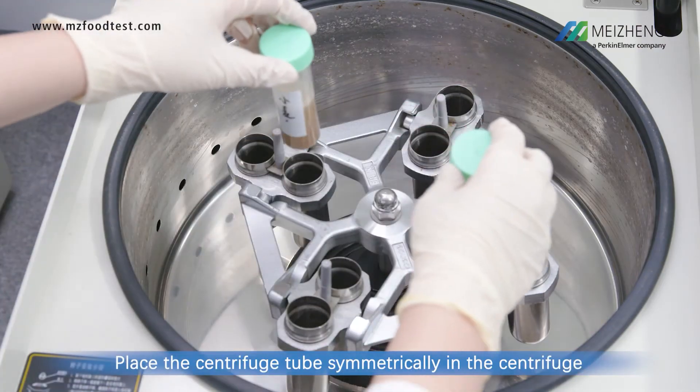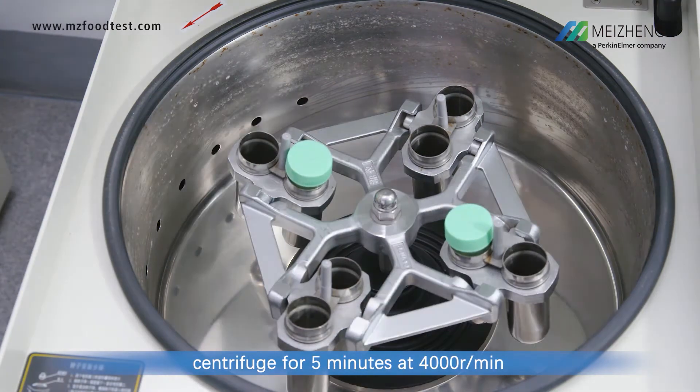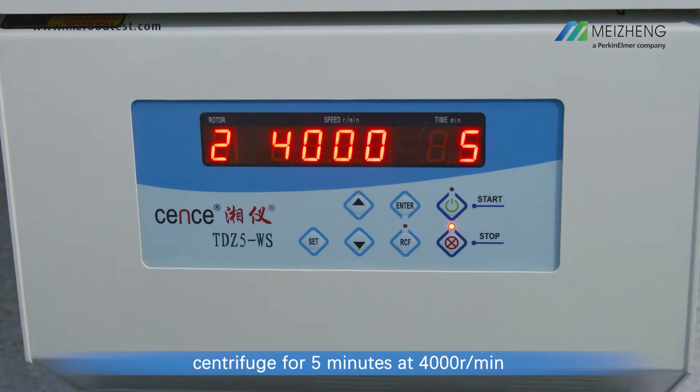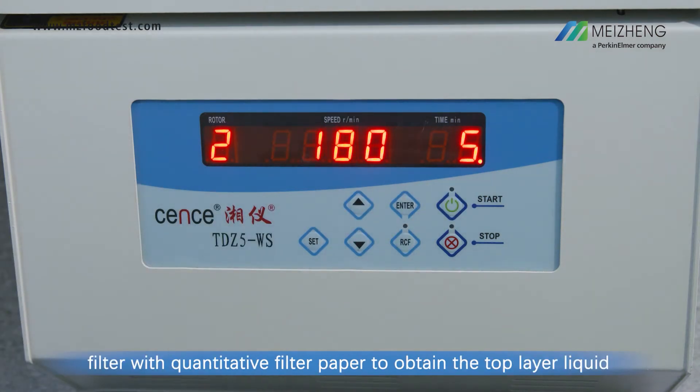Place the centrifuge tube symmetrically in the centrifuge. Centrifuge for 5 minutes at 4,000 revolutions per minute, or after standing for 3 minutes, filter with quantitative filter paper to obtain the top layer liquid.